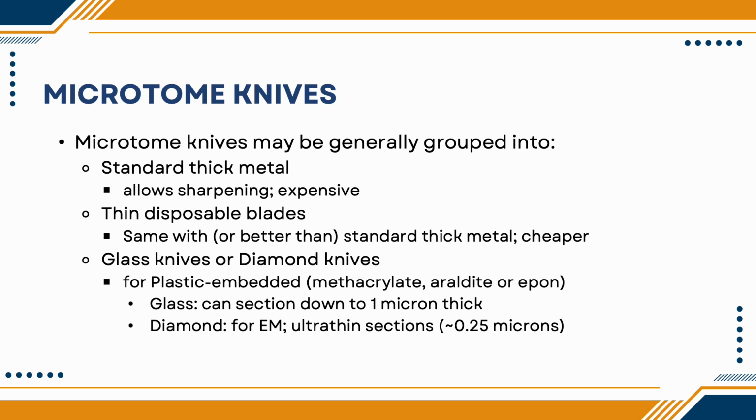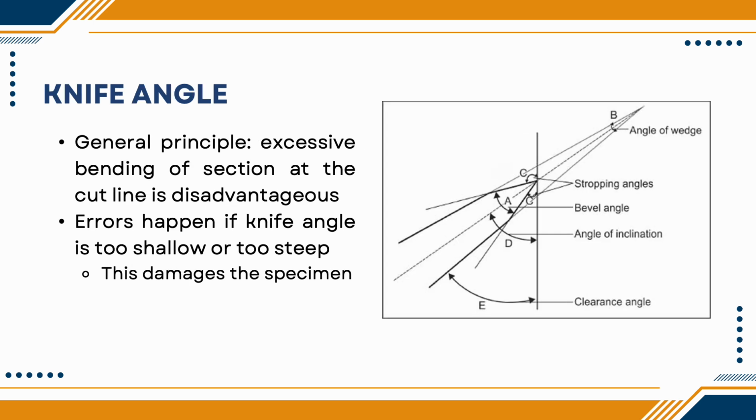That is basically the thinnest section we could achieve using diamond knives. Where is it used? For ultramicrotomes.